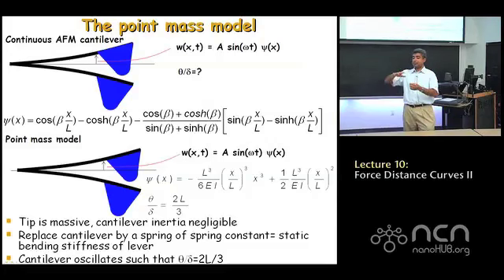But if you think about it, the cantilever spring constant calculation assumes that it bends as a cubic polynomial when you have a static force applied to it. And when that is true, we derive this expression, cubic polynomial, when you have a point force applied at the end, you get the relationship that theta and delta, where theta is the bending angle that you actually measure and delta is the actual deflection, are related by 2/3 of the cantilever length, okay? However, in reality, when you drive the first eigenmode of the cantilever at resonance, the shape psi of x in which it vibrates is no longer a cubic polynomial. It is a more complicated expression. We're going to do this in detail, don't worry.